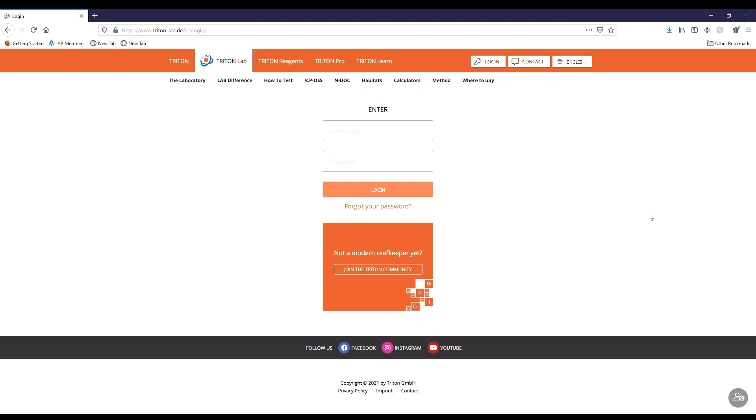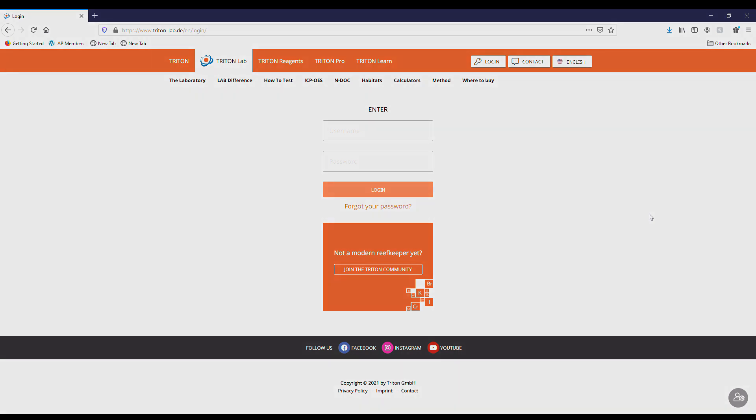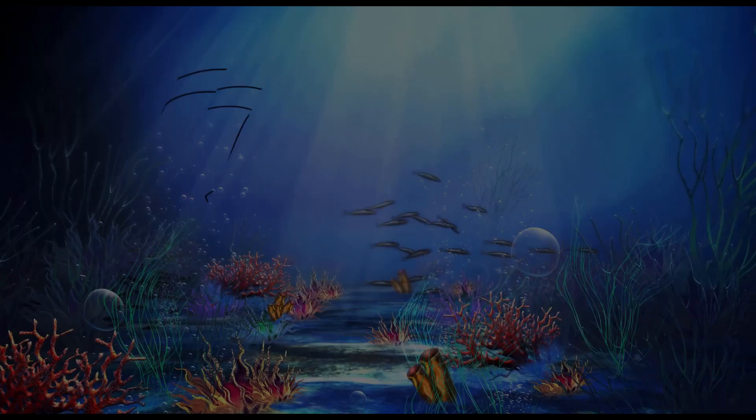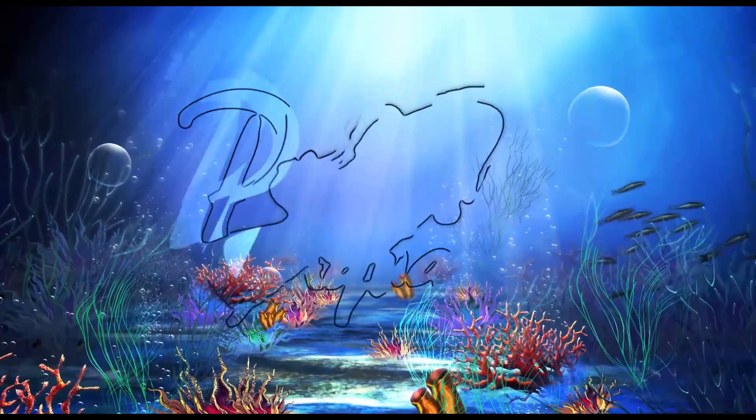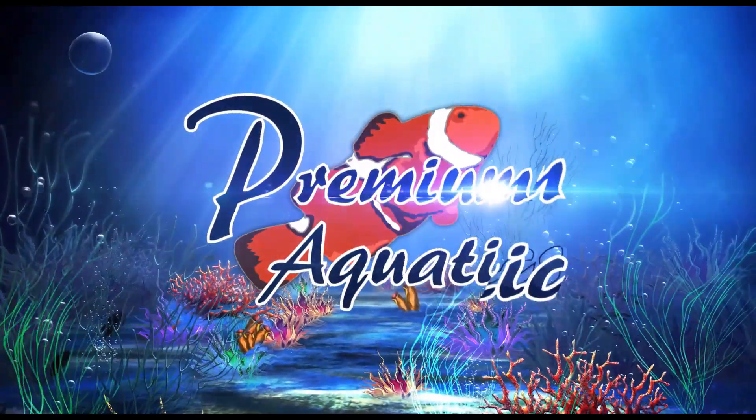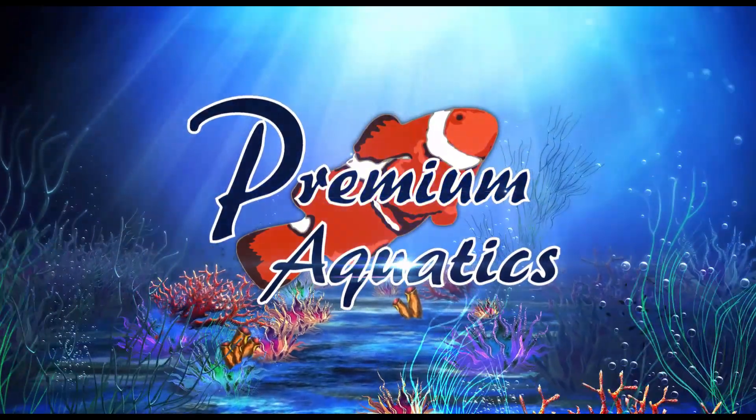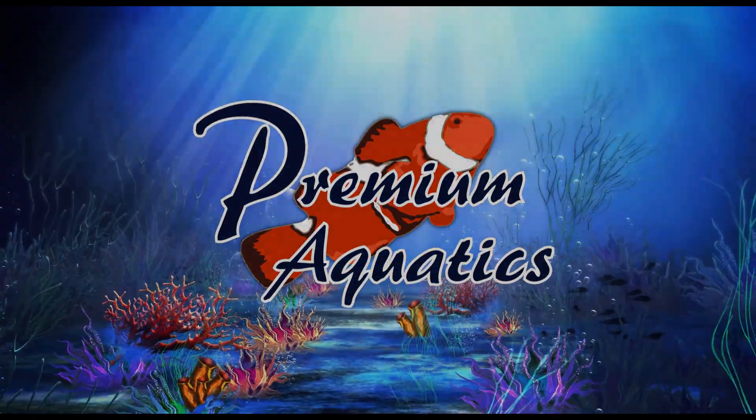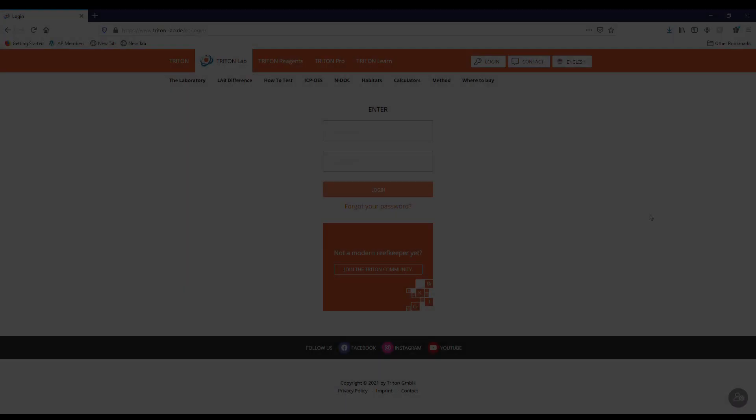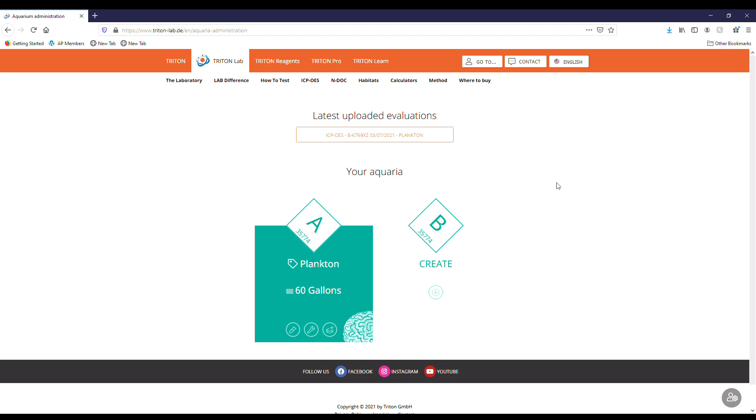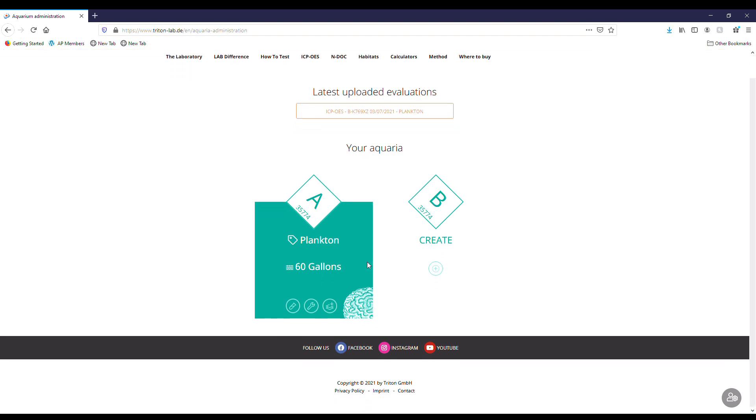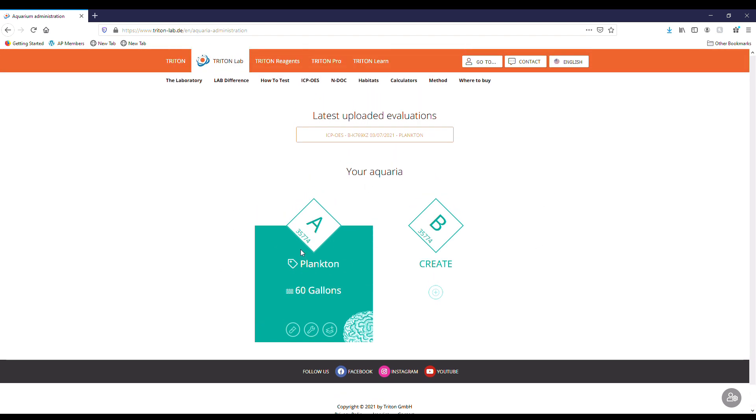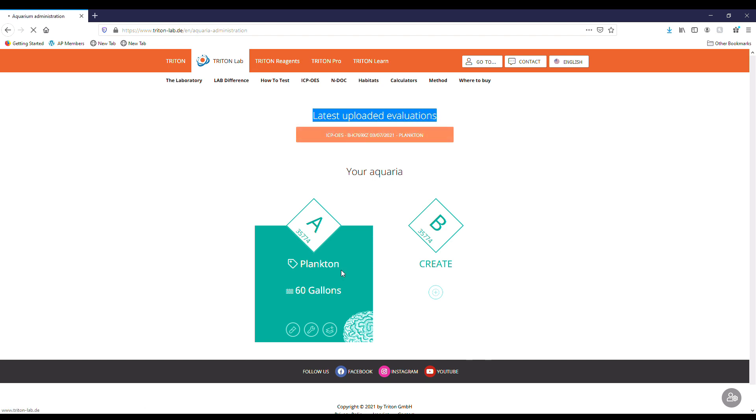So from Monday to Saturday I had my results, which was phenomenal. I think that's amazing because it's a pretty quick turnaround as opposed to waiting 14 days or something crazy like that. So let's jump right into this. Let's go ahead and go to our Triton Lab account and log in. Once we're in here we'll see the tank that we registered and our latest upload evaluations, which is my ICP test that we did.